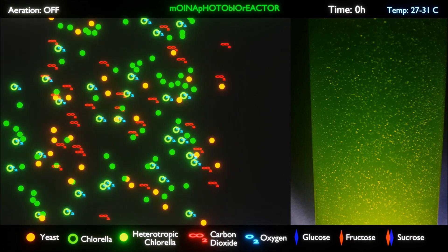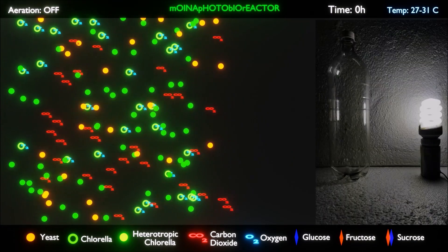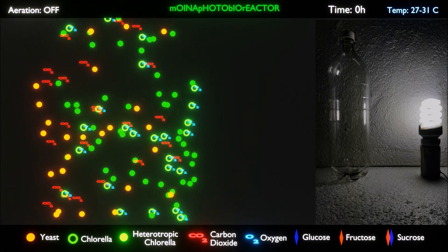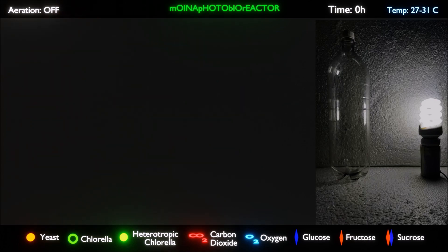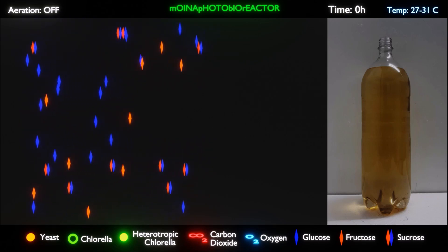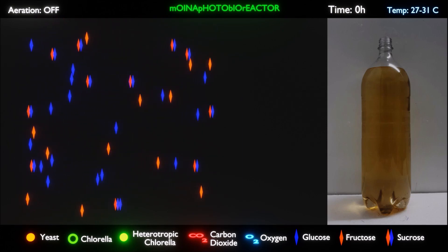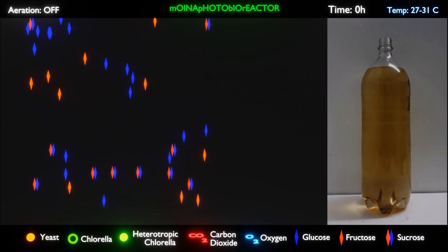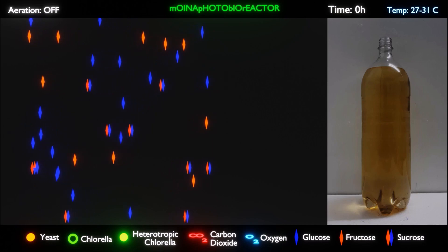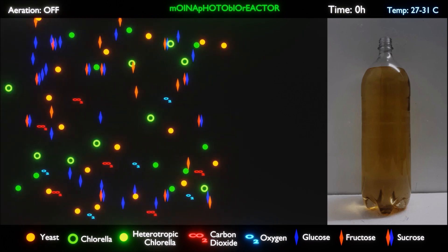When the medium cannot contain more dissolved gases, bubbles are formed on the vessel as shown in Part 1. The plastic transparent bottle has a diameter of 10 centimeters. For photosynthesis, a 36-watt lamp is placed 20 centimeters away from the plastic bottle. Medium B is prepared by dissolving 1 milliliter of molasses per liter of dechlorinated water at a temperature between 27 to 31 degrees Celsius. In the transparent airtight vessel, a ratio of 25% of Medium A from Part 1 is mixed with 75% of Medium B.